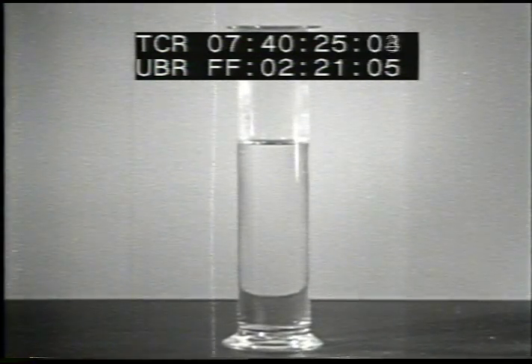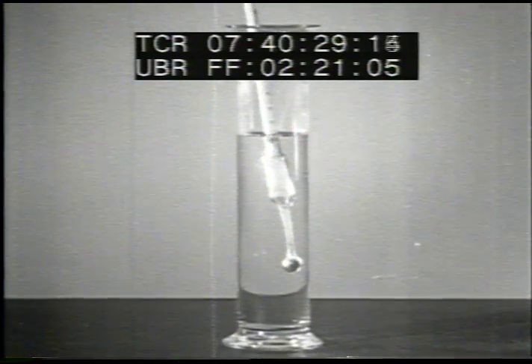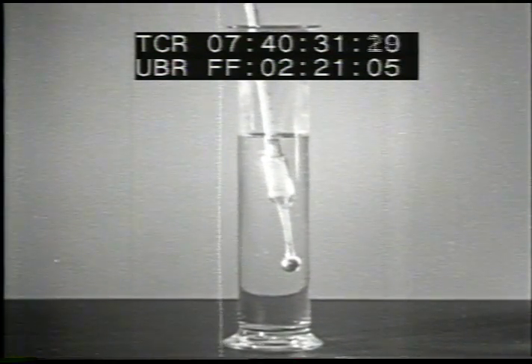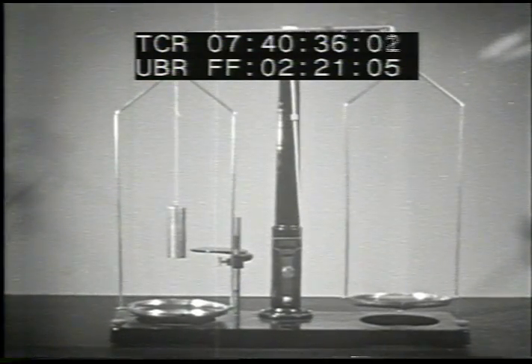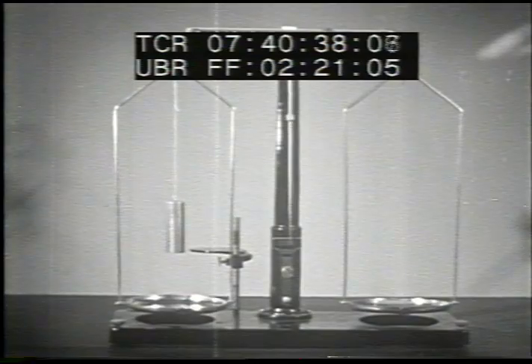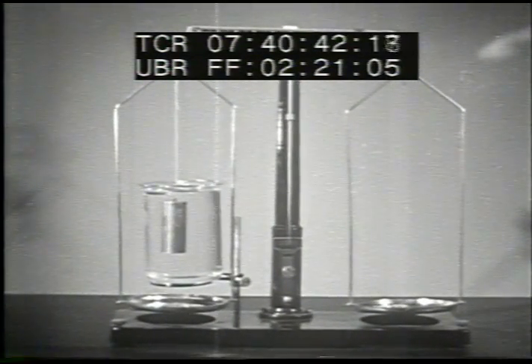The ratio of the weight of a substance compared to the weight of an equal volume of water is called the specific gravity. The hydrometer is used in comparing the densities of liquids. Solid materials, such as this cylinder, are sometimes weighed in air and in water to determine their volumes and densities.